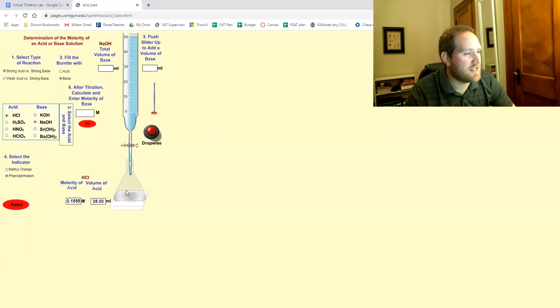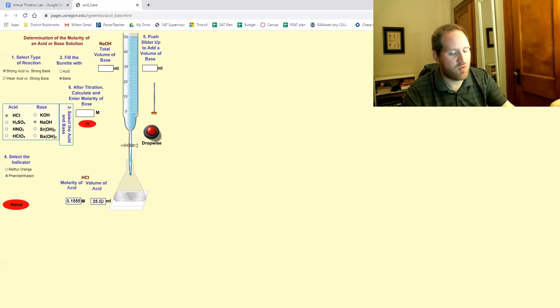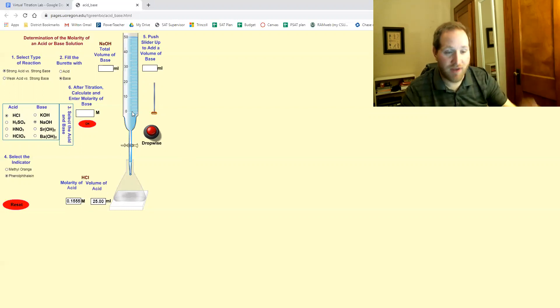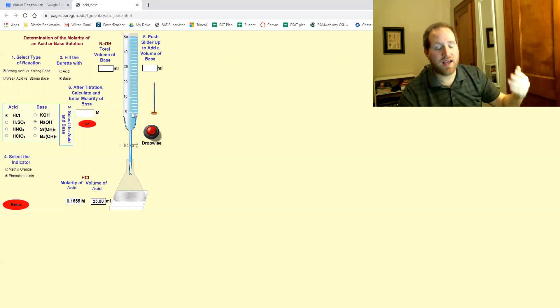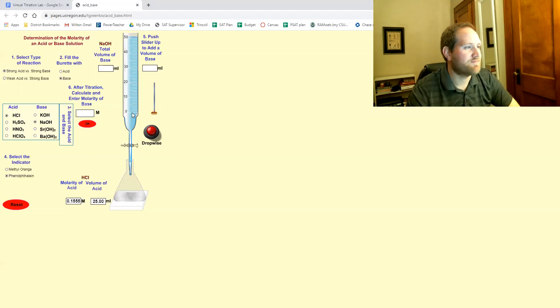So the basic idea is you have one of the molarity, you have one of the volumes, you figure out the second volume, and using that you figure out the second molarity.